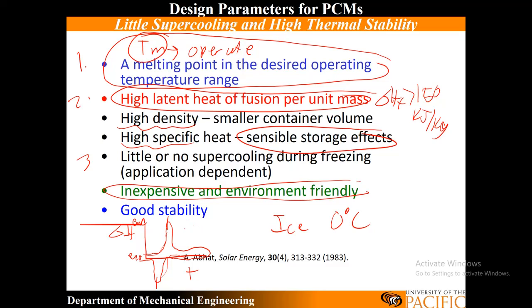Here we're heating up at a certain rate and cooling at a certain rate. If your heating or cooling rate is high, we're not allowing our material enough time to rearrange and solidify, so we're keeping it in that liquidy state.